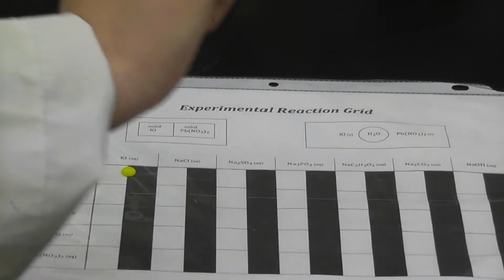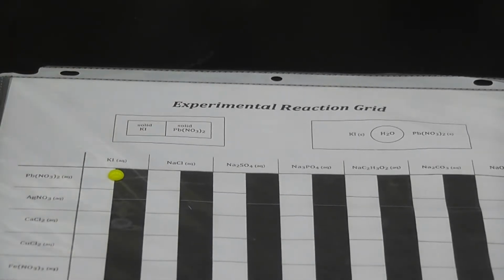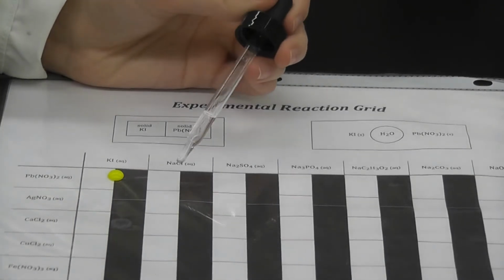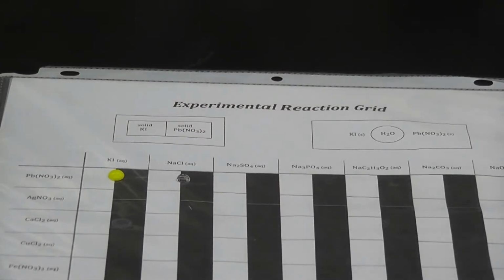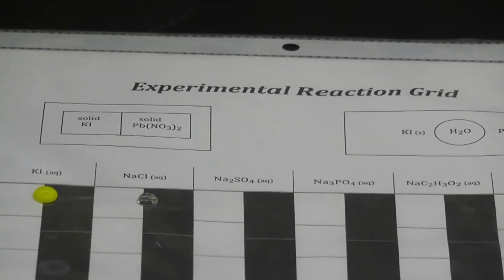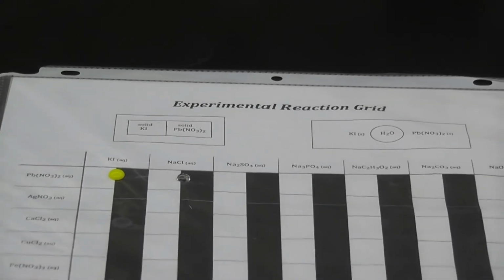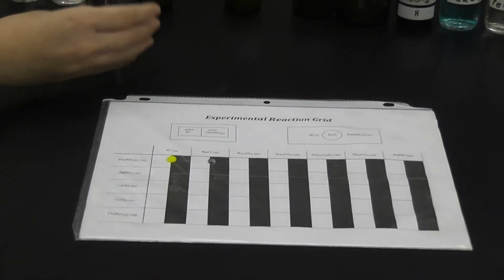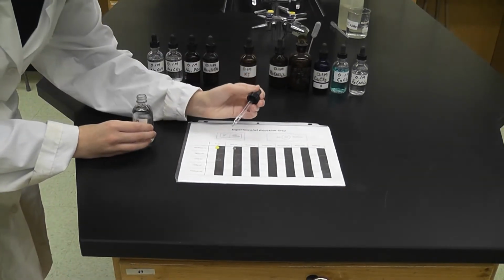Okay, let's just continue down this lead-2 nitrate line. So I'm going to add another drop going across of lead-2 nitrate. Right in between the black and white line. Okay, or somewhat. And this time we're going to be using, that is not sodium chloride, we're going to be using sodium chloride. Okay, so let's add a drop of sodium chloride. Okay, and observe what happens.